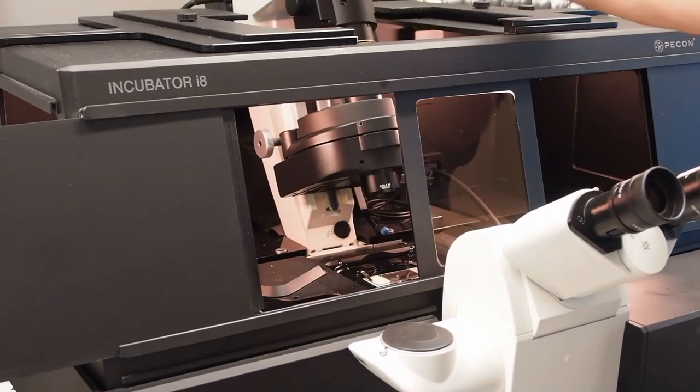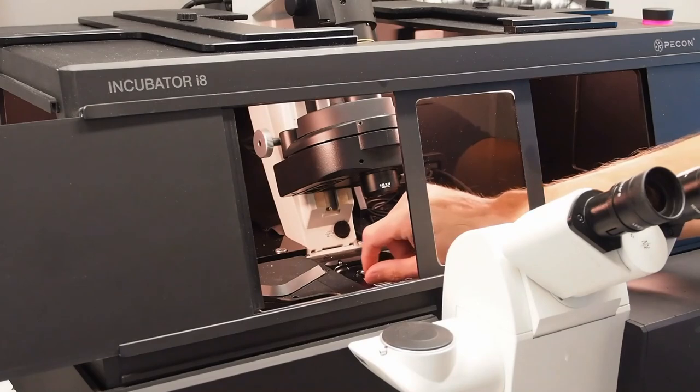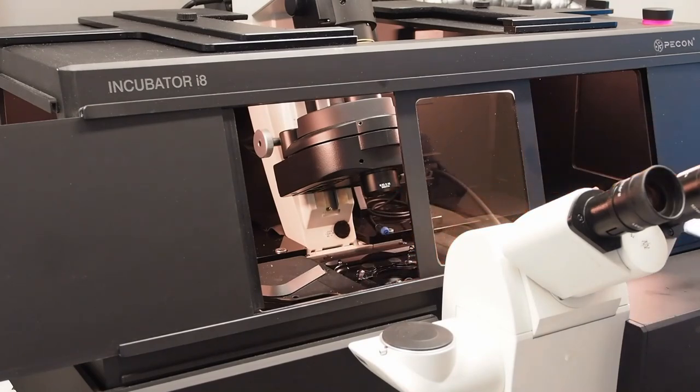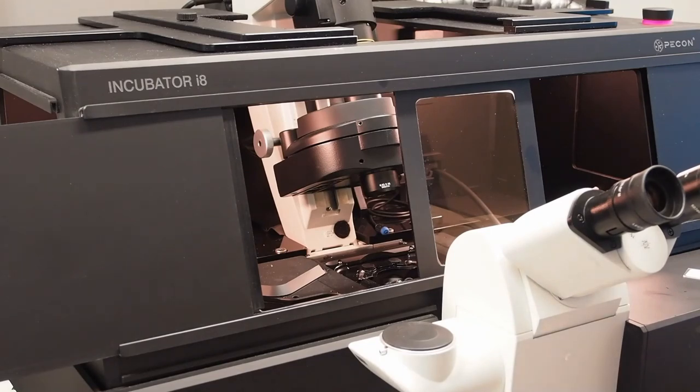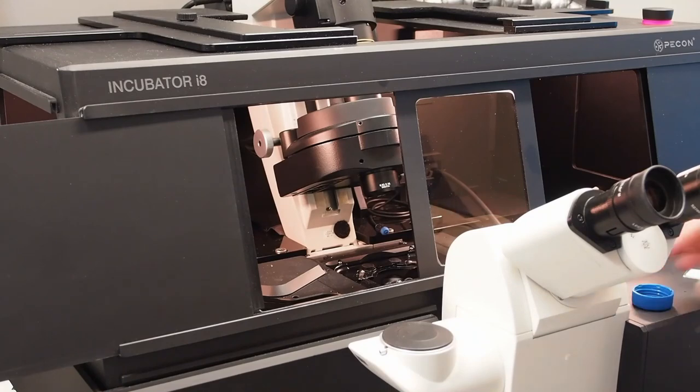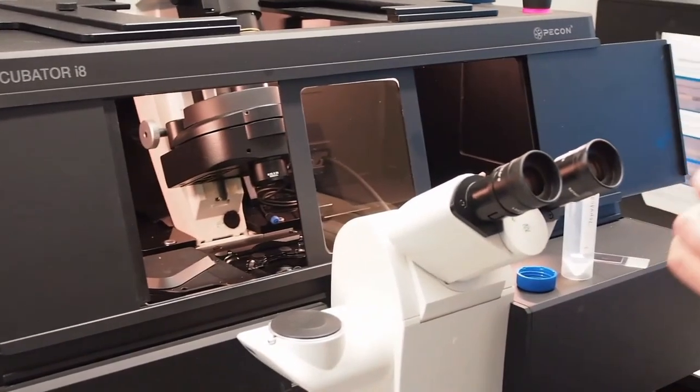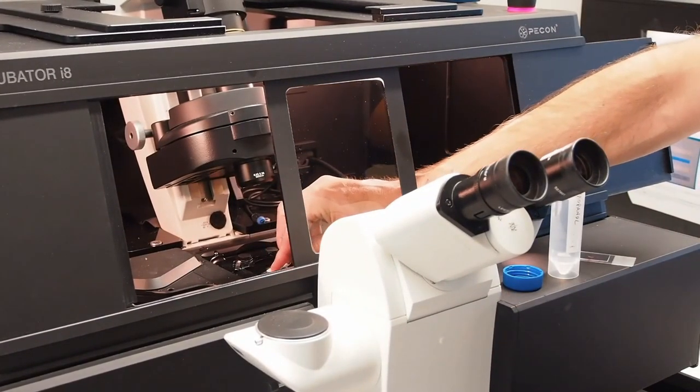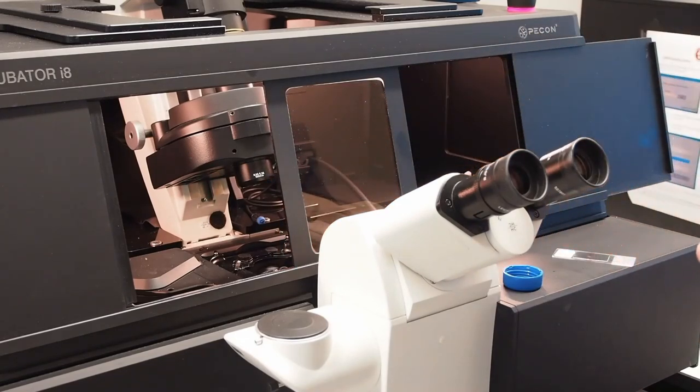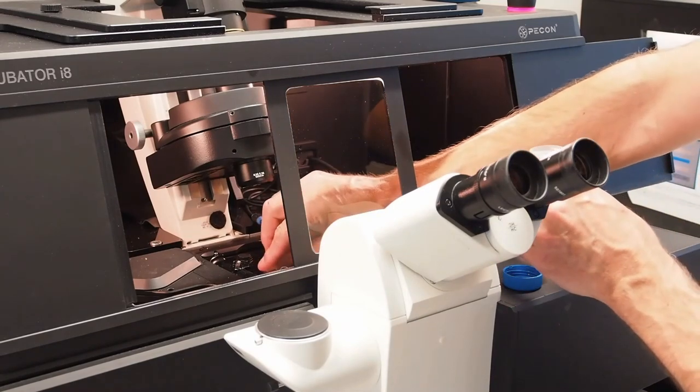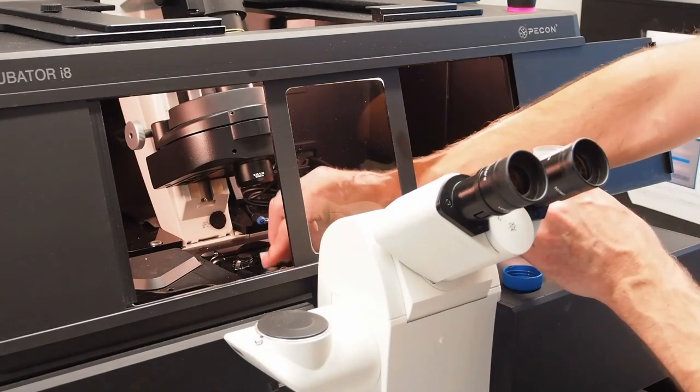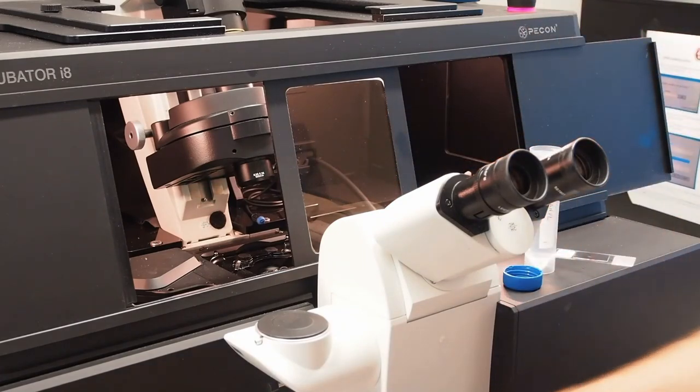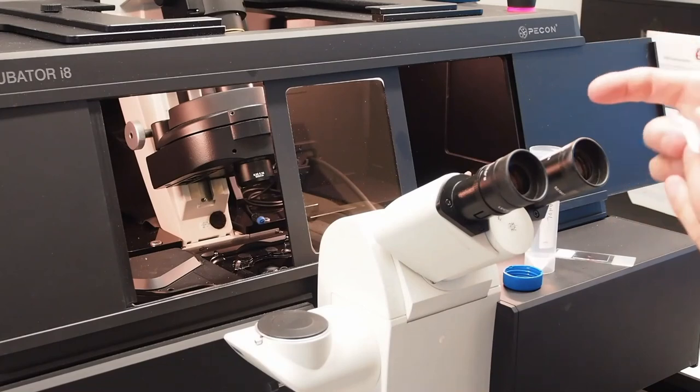Lift the condenser back and carefully remove the slide. Use a lens tissue to wipe the excess oil off. Then an isopropanol soaked tissue to clean the lens. And finally wipe the alcohol residue off.